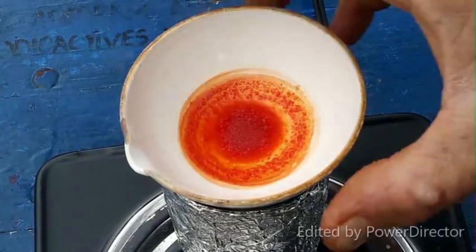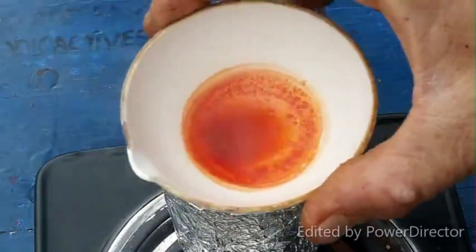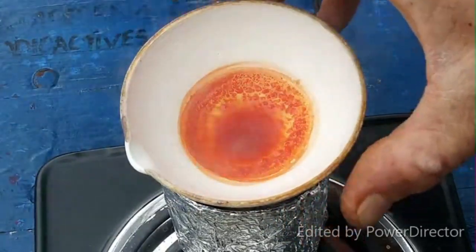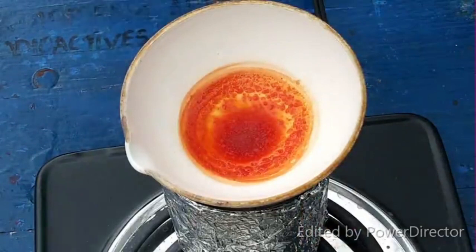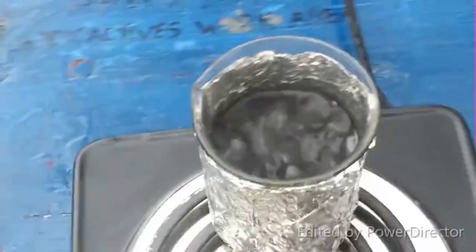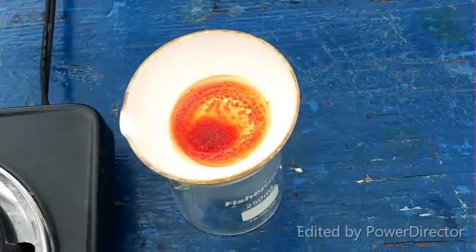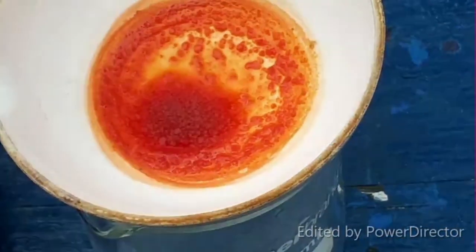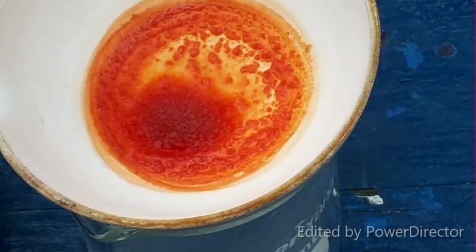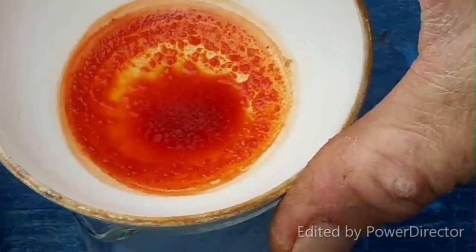Y'all are not going to believe this. Look at this - it did it. It looks for all the world like it formed an addition compound with ammonium bromide. I'll take it off the heat here because those hydrobromic acid fumes really are something else. Look at that - that is fucking cool. I really didn't think this was actually going to work out that well.